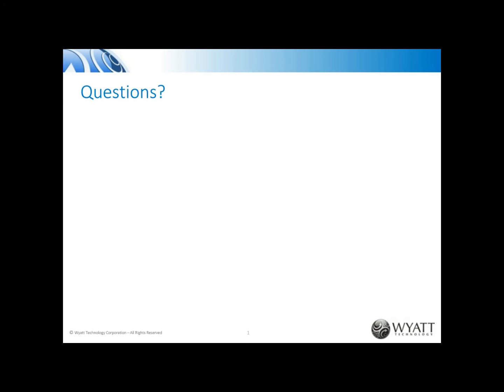I showed how you do method development using Scout. There you need to make a decision, what is the smallest size that I want to separate and what is the largest size. So if you have a dynamic light scattering measurement that gives you an indication, you can use that indication and get better and faster to a successful resolution. But if it's not available or not possible, you can start with a totally unknown sample, start with a screening method. You may need one or two more iterations in your flow programming to reach a good result, but that is also possible.